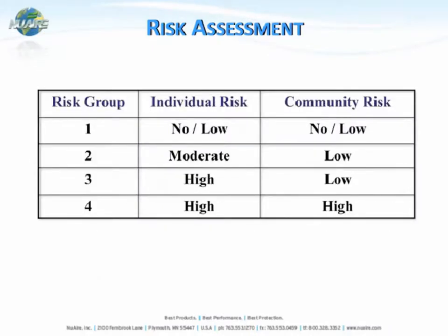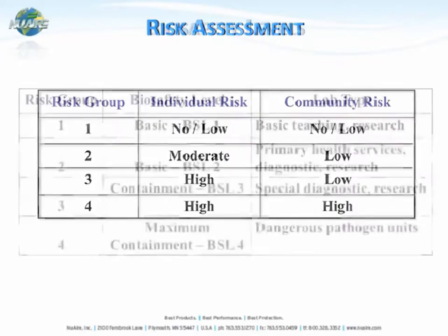The risk groups are identified as groups 1, 2, 3, and 4. Looking across individual and community risk, risk group 1 has no or low individual risk and no or low community risk, all the way up to group 4, which has a very high individual risk and a high community risk. Defining which risk group your agent falls into addresses the risk to yourself as an individual and also to the community.